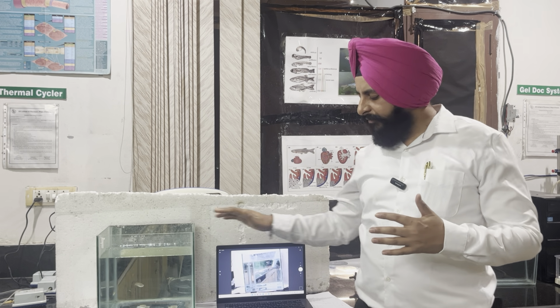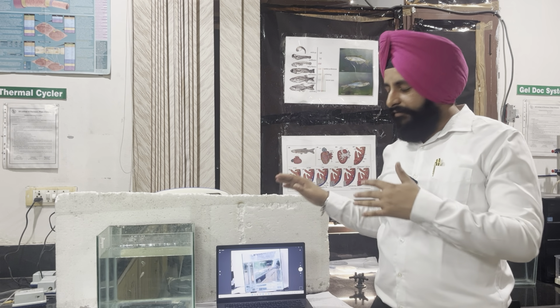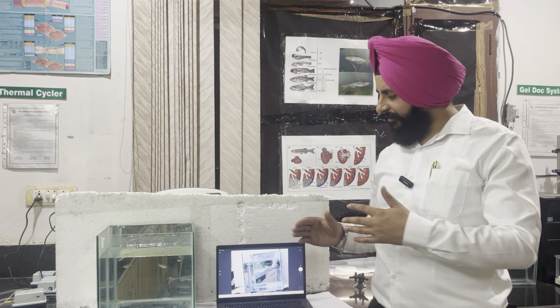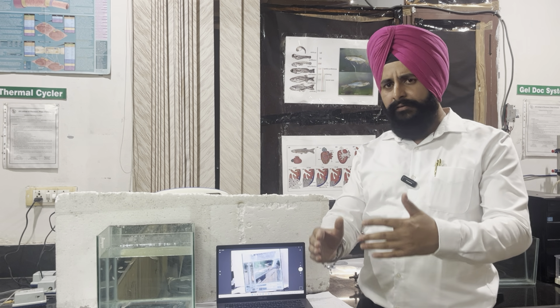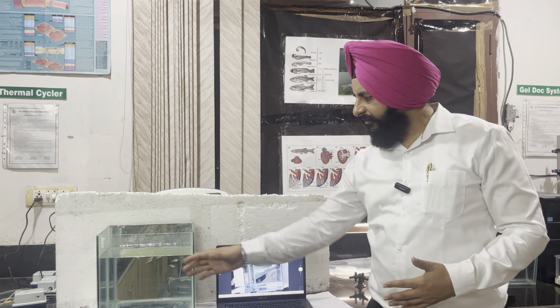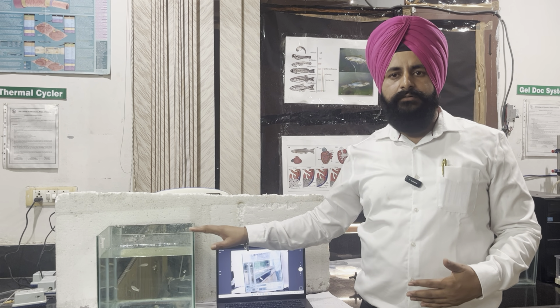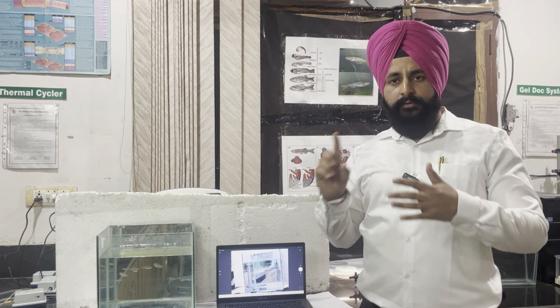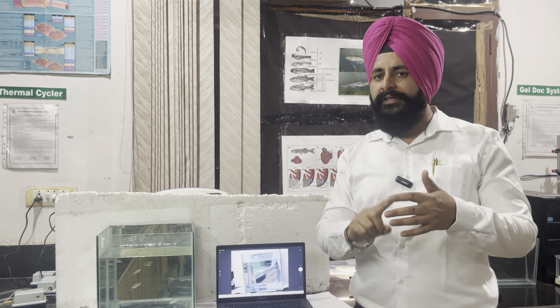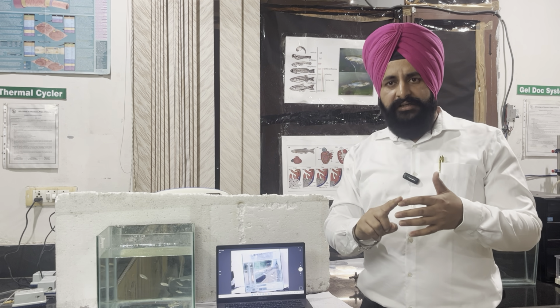This is the mirror chamber apparatus. This is a laptop which contains the software, and this laptop software is connected to a webcam, so you can see that our webcam is directly targeted at this side, and it is analyzing the movement of the zebrafish in the apparatus called the mirror chamber apparatus. So the first aim is to induce acute and chronic anxiety in a zebrafish using a mirror chamber apparatus. This is the aim of the practical.